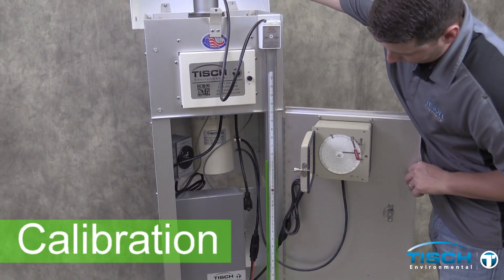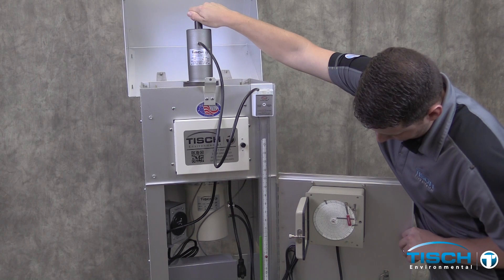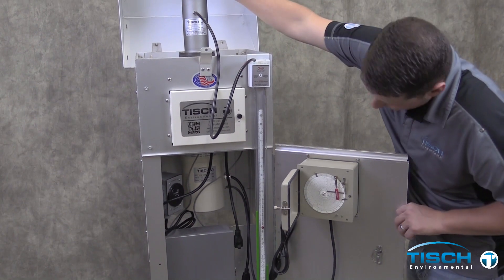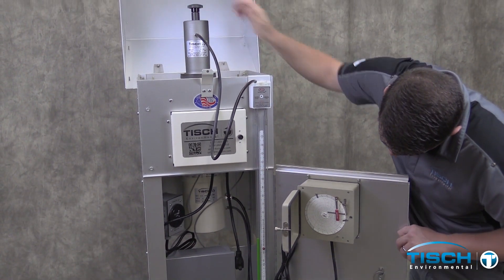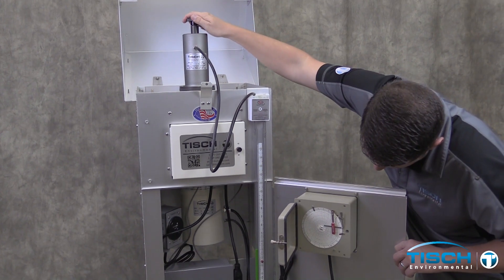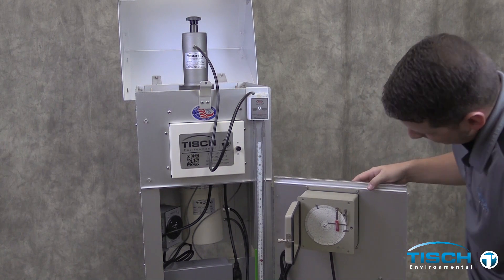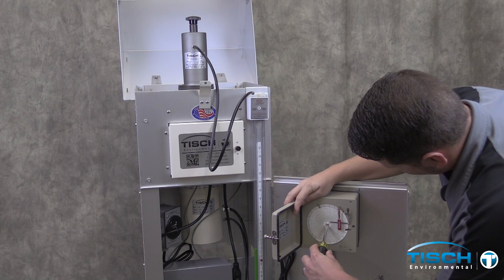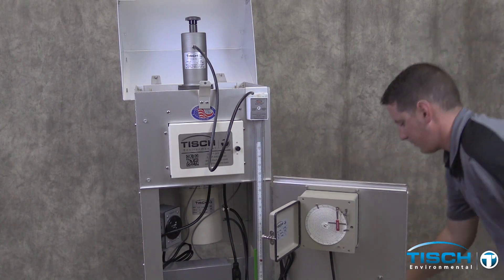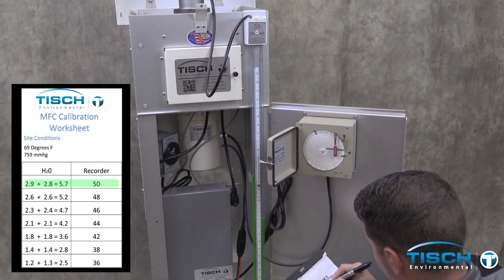Start with the knob on the calibrator turned completely counter-clockwise. This will open the four holes on the bottom of the calibrator. Turn the knob clockwise to get the pen on or about 50 on the chart. Tapping the front of the door will settle the pen. Make sure the pen cap has been removed. You can use a straight-edge screwdriver to turn the chart drive clockwise to make a mark on the chart. In our example, the first number was 50 on the chart.